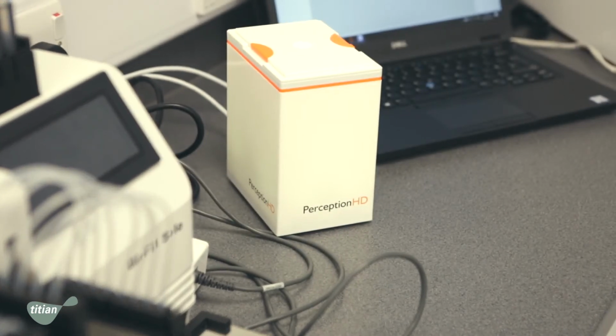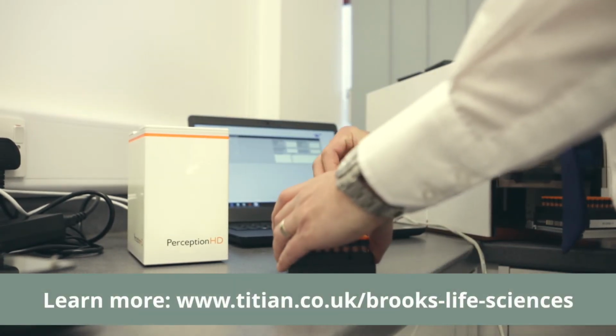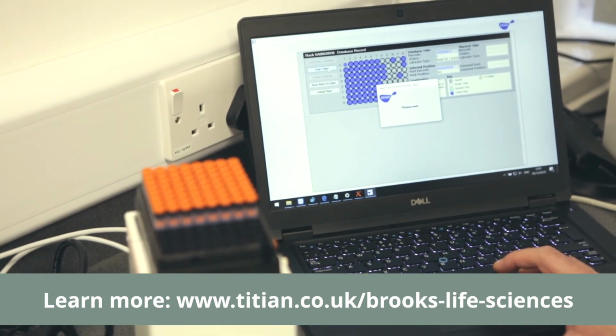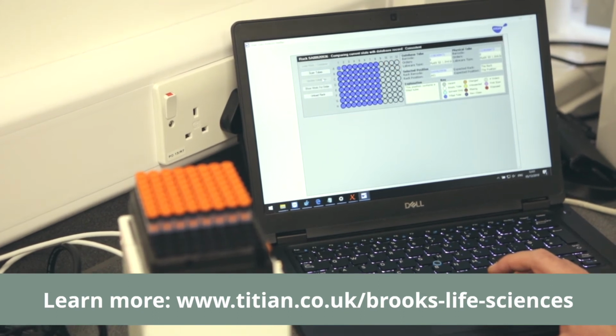The integration with the Brooks tube rack scanners is through our application called TPV, which stands for Tube Position Verifier. It simply does that. It verifies positions of tubes in racks. For example, if you drop a rack and the tubes spill out, it's going to be near impossible to get all the tubes back in the right place. So you can put your tubes back anywhere, scan them on the tube rack scanner, and Mosaic's database will be updated to rectify the new positions of those items in the rack.